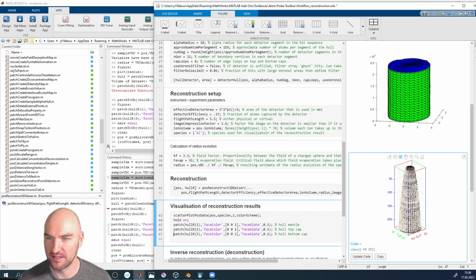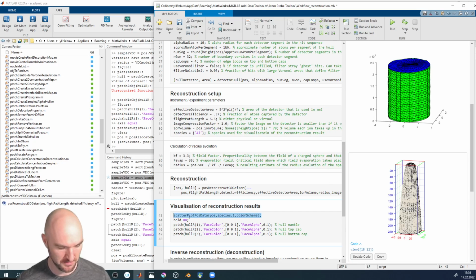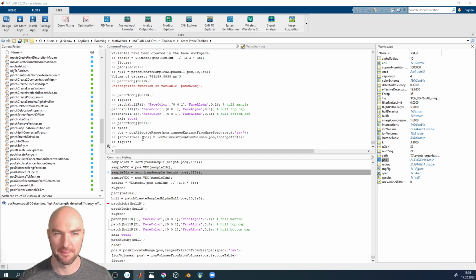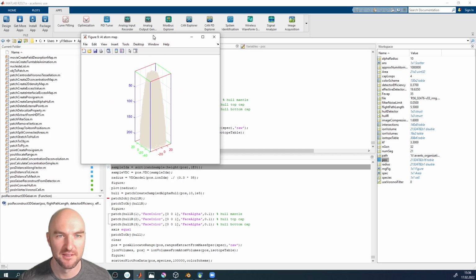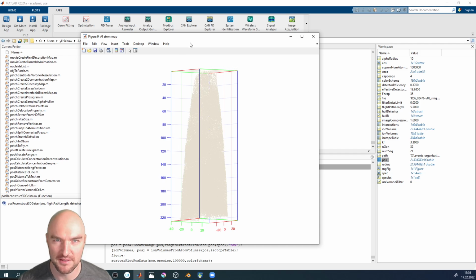In this reconstructed data set, we've got our aluminium, and I will just plot the aluminium maybe separately as well. And maybe we're just gonna plot 100,000 atoms. No, that's 10,000, 100,000 atoms. Is that too much? Probably is.